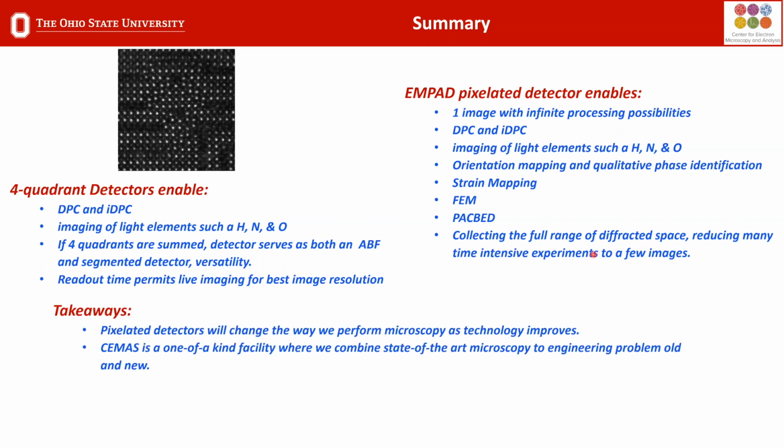A couple of takeaways I hope you walk away with: pixelated detectors are going to change the way you perform microscopy, and as technology improves, I think you're going to see the growth of these EMPAD or pixelated detectors to the point that it might be one of the only detectors in the microscope because of how robust it is and what it provides you.